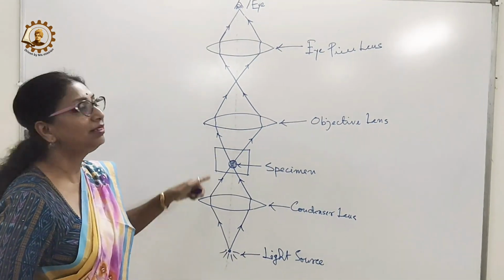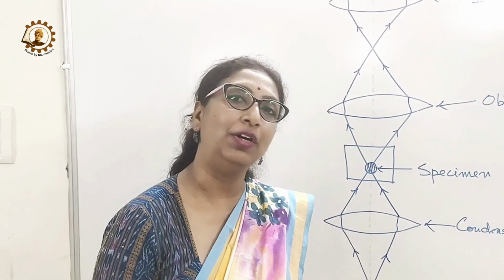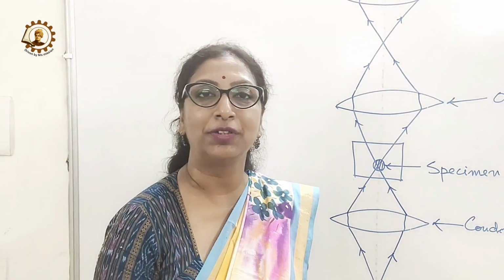So now this is the final and proper optical pathway of light microscopy or bright field microscopy. Hope it will be helpful for your study.